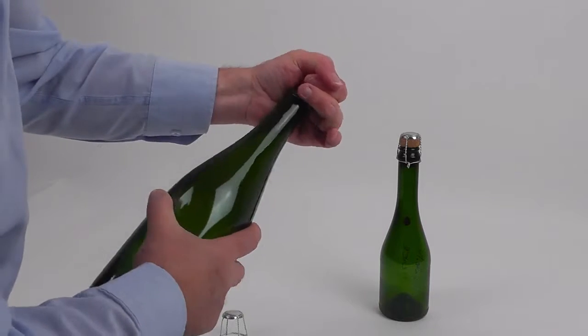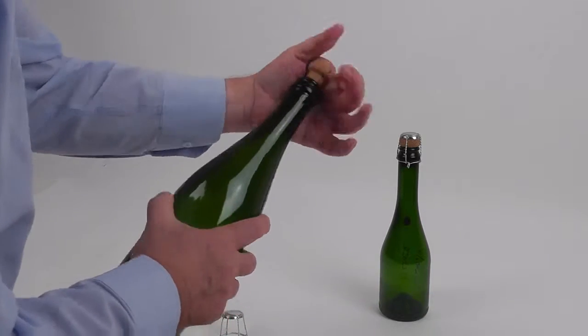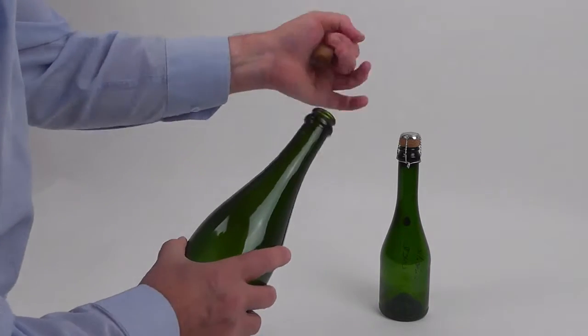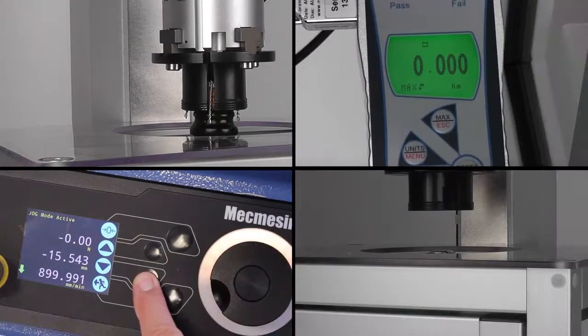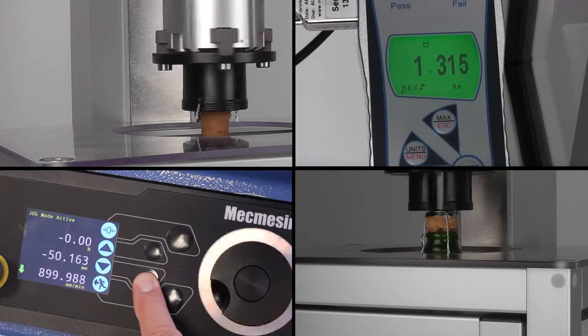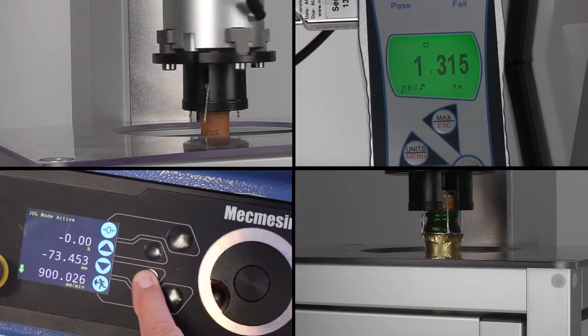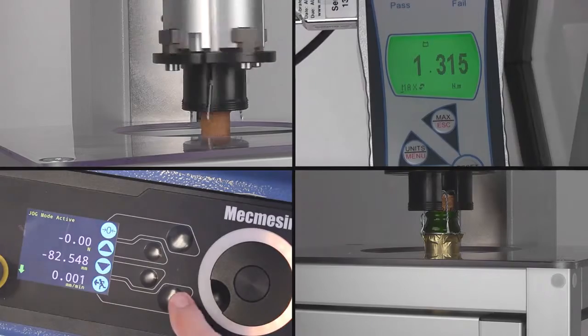It removes the subjectivity associated with the traditional method of a person judging how easy it is to remove a cork by hand. By using a motor driven system, the torque is applied consistently at a constant speed. This ensures repeatable testing.